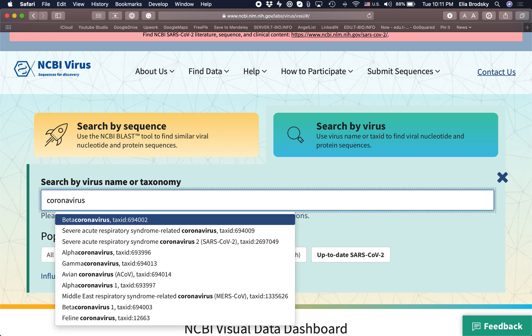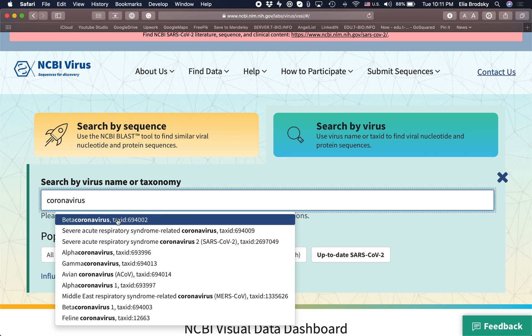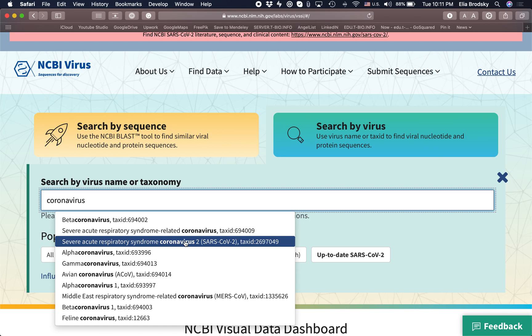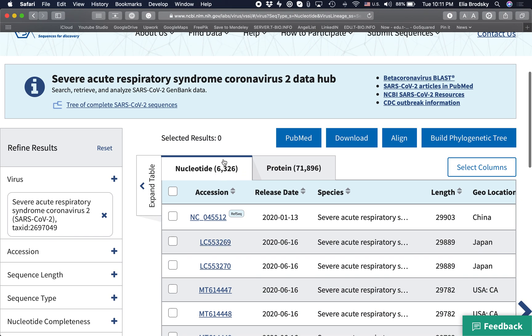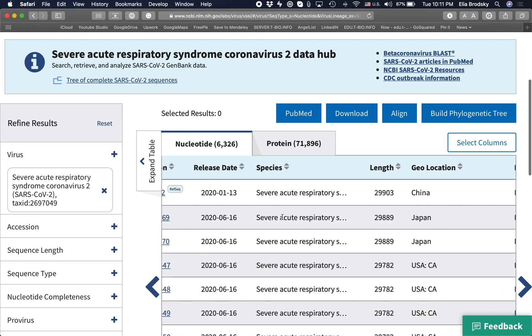Give it just a few seconds and you'll see the list of coronaviruses appear. Let's select Severe Acute Respiratory Syndrome-related coronavirus, or SARS-CoV-2, which is the novel coronavirus causing COVID-19. As you can see, there are over 6,000 nucleotide sequences available in this list. Not all of them are full genomes, and they come from a variety of different locations and were collected or released at different dates.